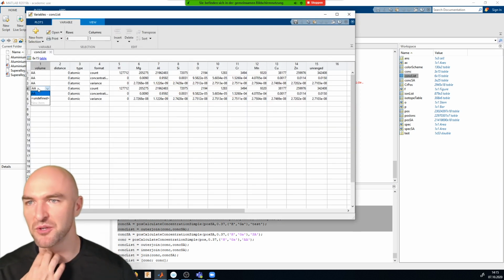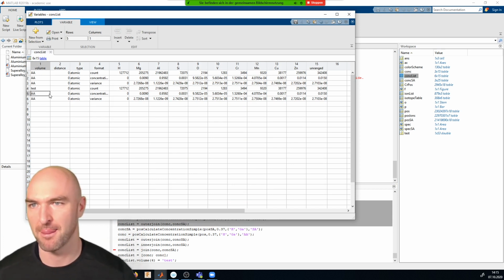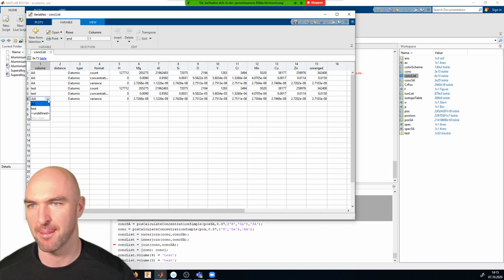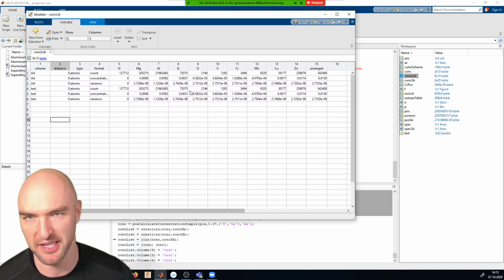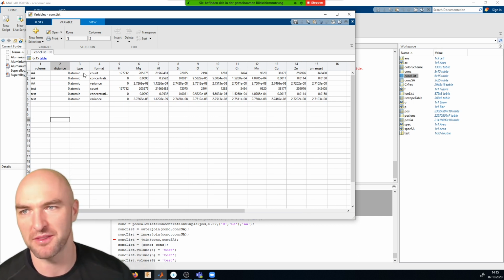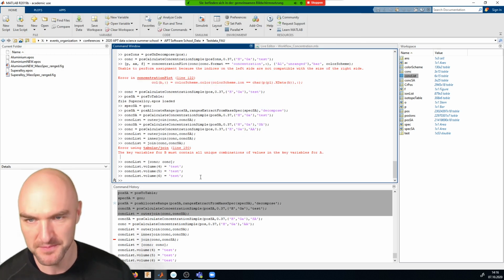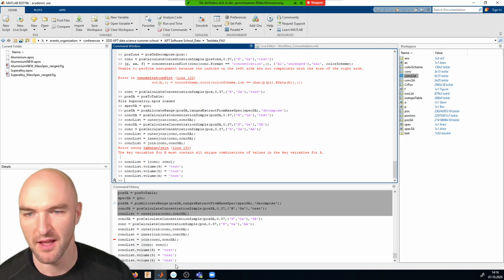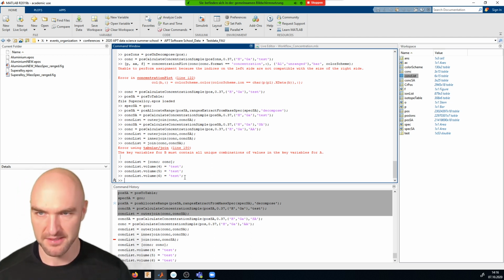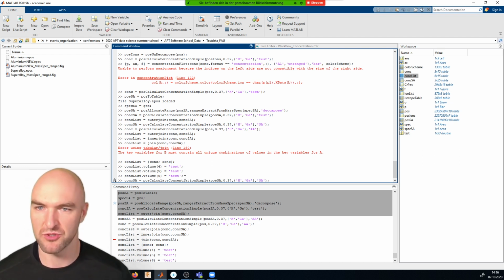So now I've just taken the aluminium data set and put the concentration in here twice. So usually you would mostly do that with things that have to contain the same element or the same things generally. The screen recording is still going, yes. So if I do that, I can do a concentration plot.